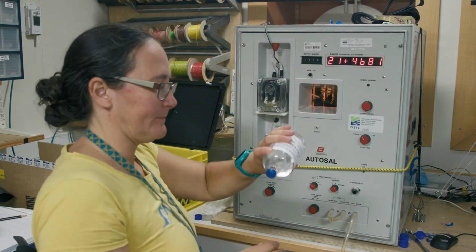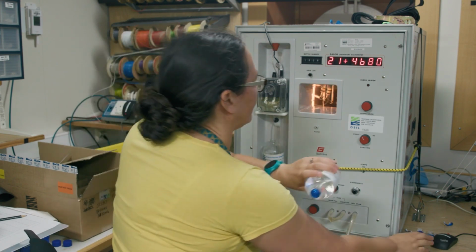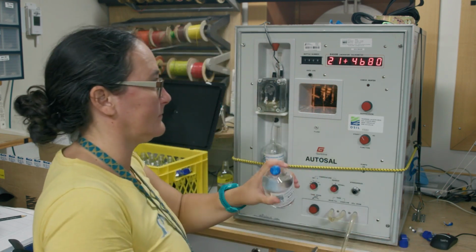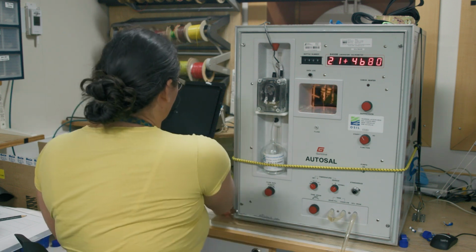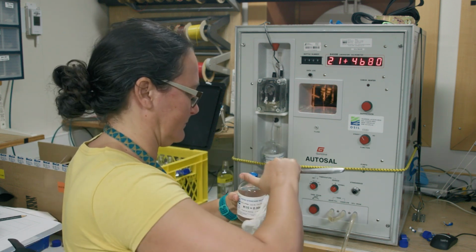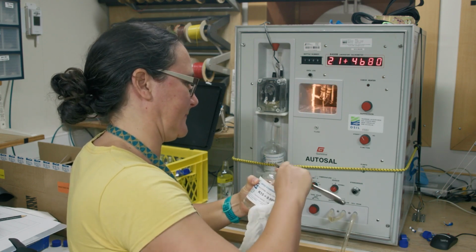Once it's close, take a brand new sealed bottle of standard seawater and overturn it thoroughly to mix. You want the bottle to be well mixed without introducing too many bubbles. Although large bubbles will rise to the surface, the very small ones will rise slowly or stick to the side, and they may then be drawn into the sampling tube and then get stuck in the conductivity cell. When you are ready to run the standard, after mixing, carefully remove the foil seal and the rubber bung.